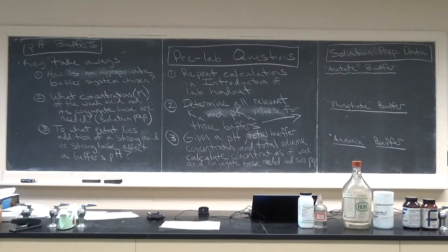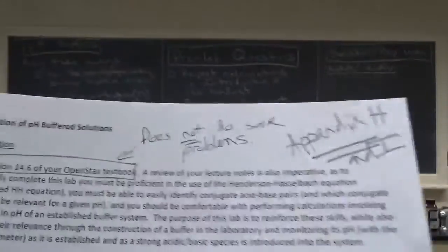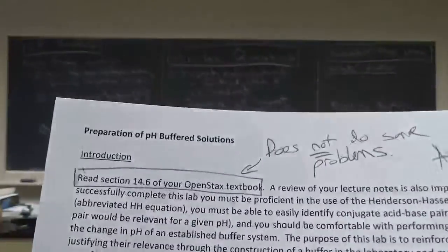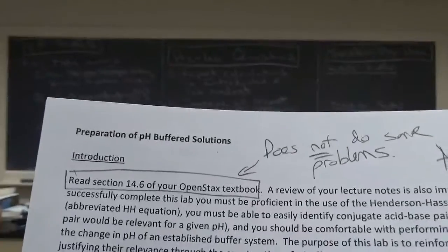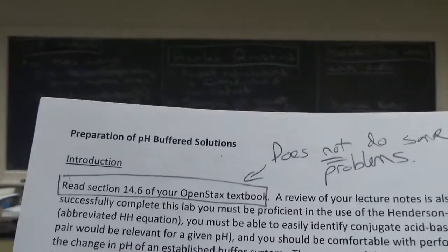We are approaching our last few labs, and this one, as usual, this is my rough draft, making some notes on here. This is the buffer lab. Now, most of this lab is actually calculations.